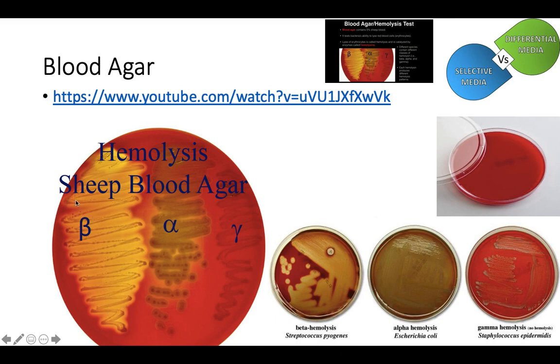Staphylococcus aureus, you shouldn't be putting it on here anyway. But if you do on accident, this is what it will do. E. coli, a couple of other species, some species of E. coli are beta hemolytic. It just depends on the species. Beta hemolysis. So what's going to happen? Species that are beta hemolytic.